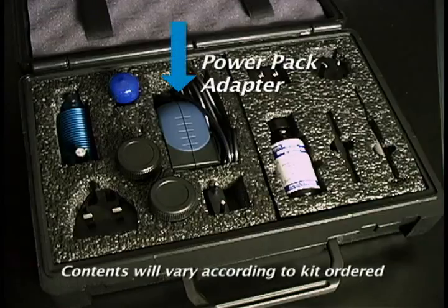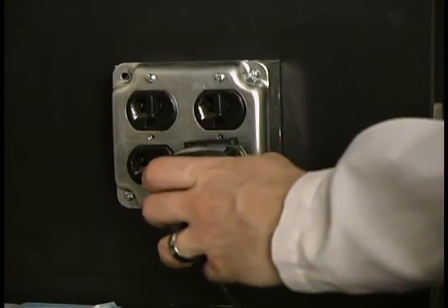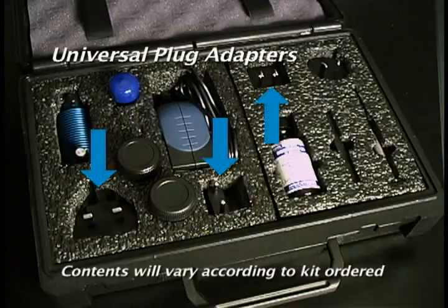The power pack adapter is inserted directly into the LED light source and then plugged into any approved electrical outlet. Universal plug adapters, which are provided, allow the Paralyns Advance to fit into the various outlet configurations around the world.